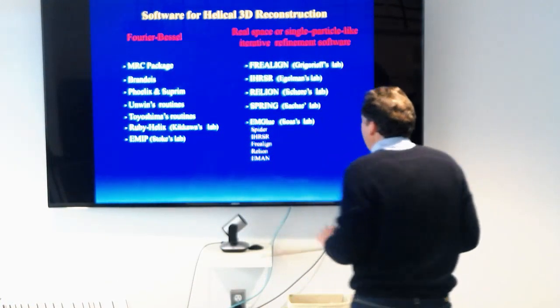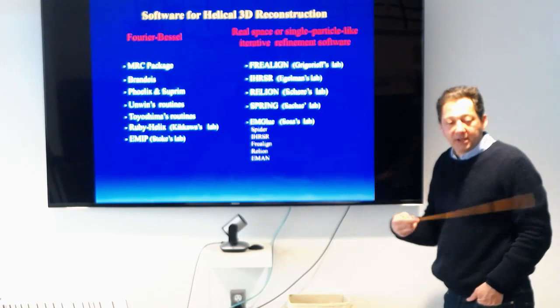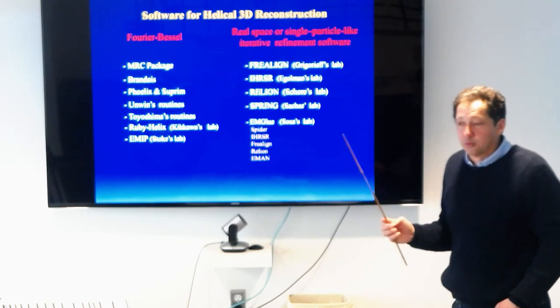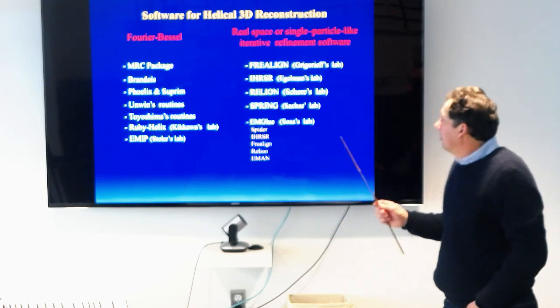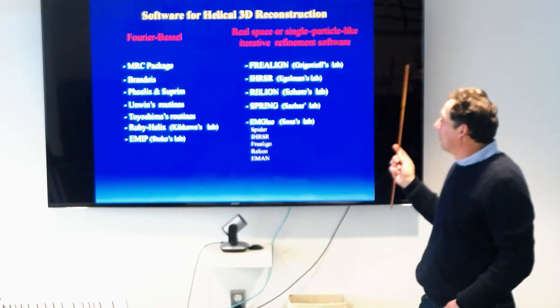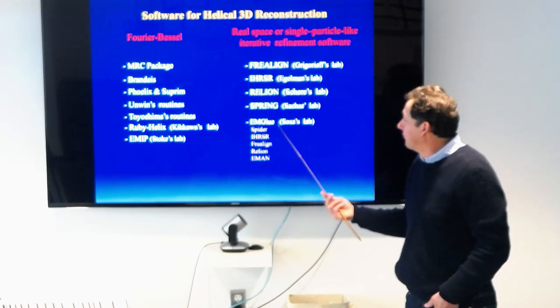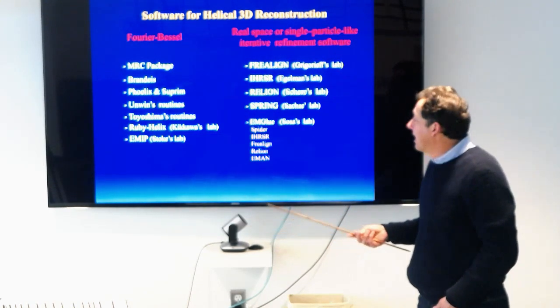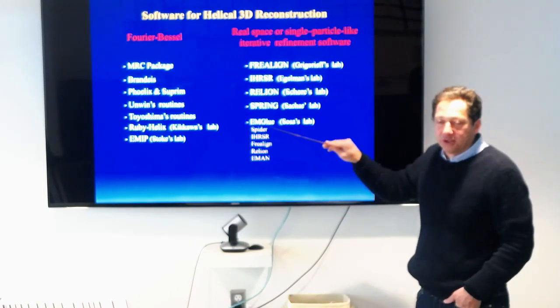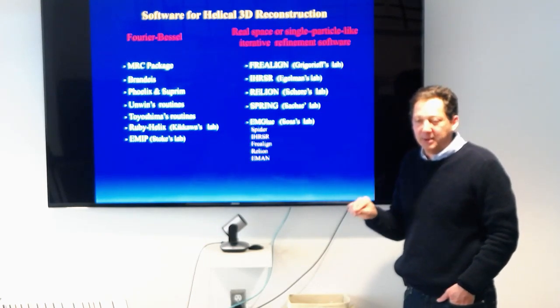Software. Everybody now is using RELION for single particle, and RELION has a plugin to do helical reconstruction, and that's fine. That works well. Maybe because I come from the old times, but we use our own series of methods, which use a little bit of everything. And the only thing I can say is that when you understand your system, I find it much better because we can really tweak it to the specimen that we have.